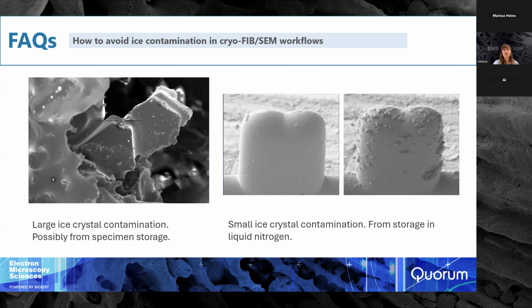And then also it is important to note that if you are doing FIB processes, to an extent you can remove some of this ice contamination with the FIB beam itself, but obviously the less contamination you build up, the better the sample is going to be.